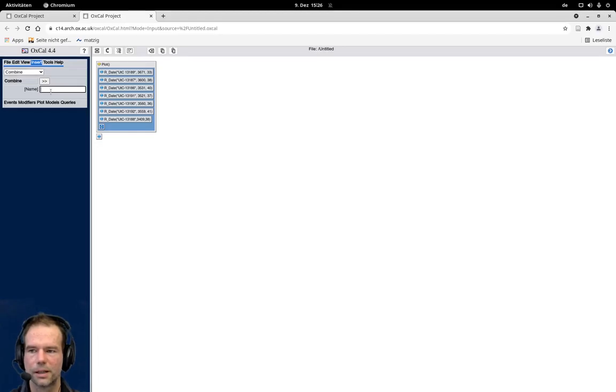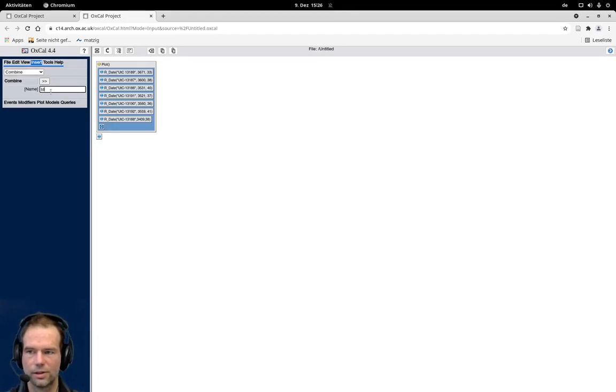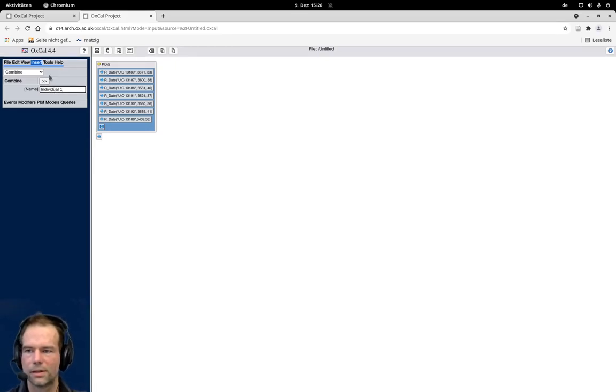But here we just want to combine two dates, so I choose combine, and I can give this a name. Let's say I call that individual one, and I can insert this here.